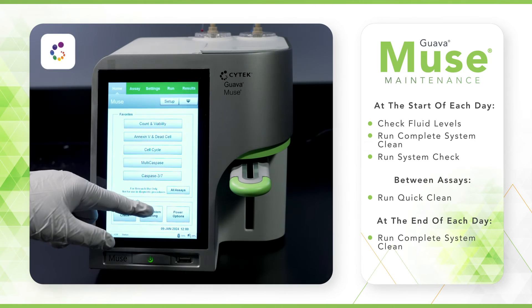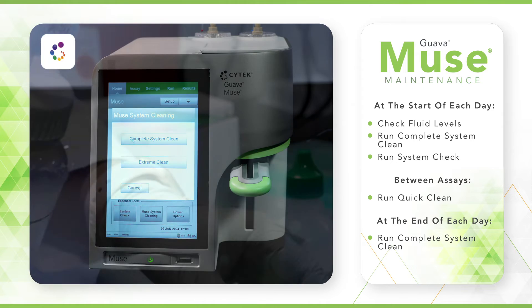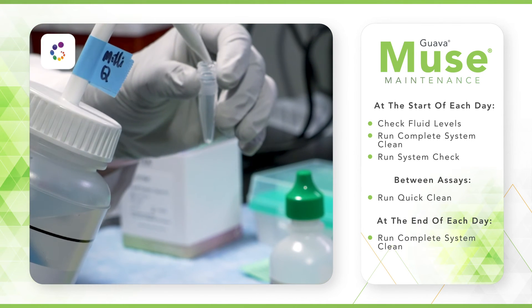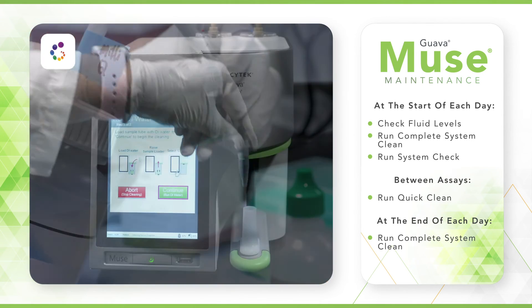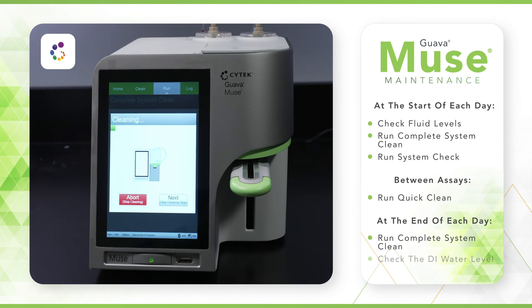When you have finished running samples for that day, always perform a complete system clean. Remember to fill the vial with DI water and lift the loader arm to the up position. If you will not be using your Muse for an extended period of time, remember to check the DI water level periodically to ensure the tube does not dry out. This is important to avoid flow cell clogs.